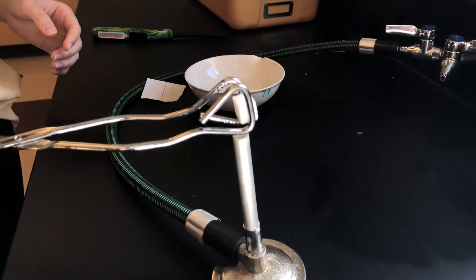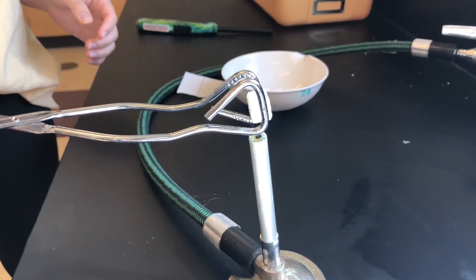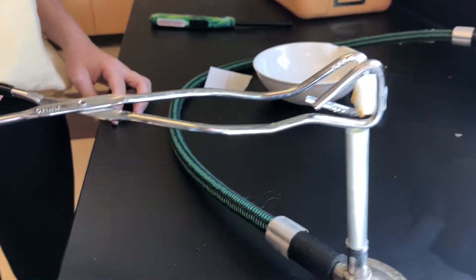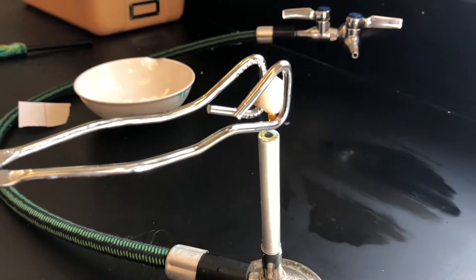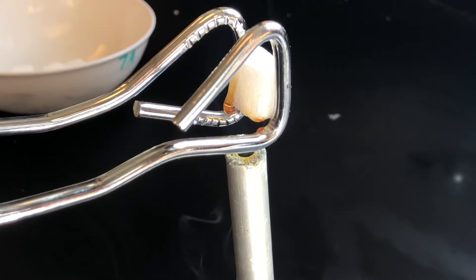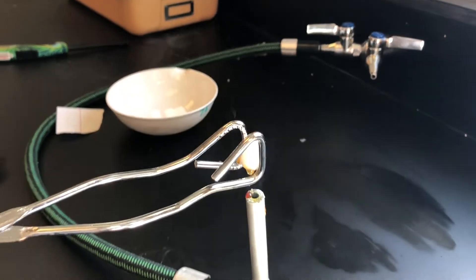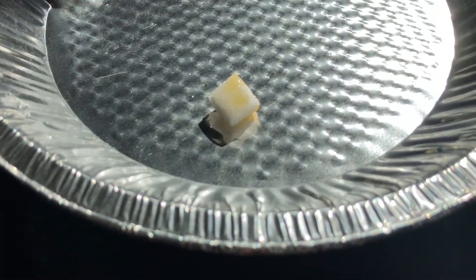Using the tongs, pick up the sugar cube, hold it over the candle flame, and observe what happens. Place the used sugar cube down in the pie tin. It's going to cool.